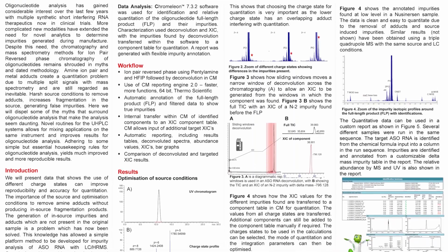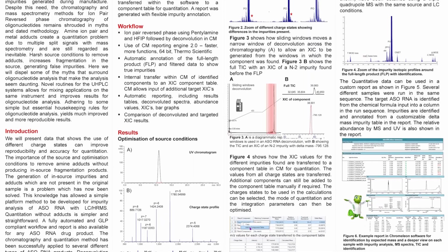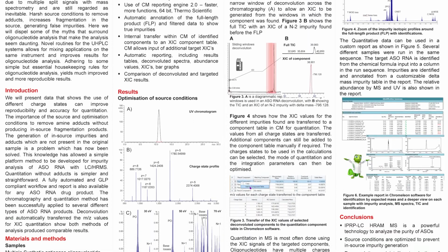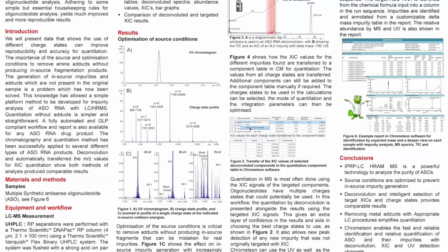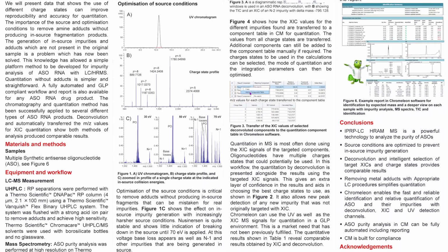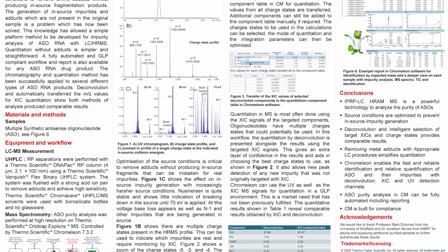So this method looks at the chromatography, it looks at the MS. You've got to have a special soft source on the mass spec to do this analysis. You can produce impurities in the source which aren't in the sample. You don't want them reported in the analytical results. But there's not many sources that are soft enough to do this analysis. The Orbitraps produce a very good soft source.